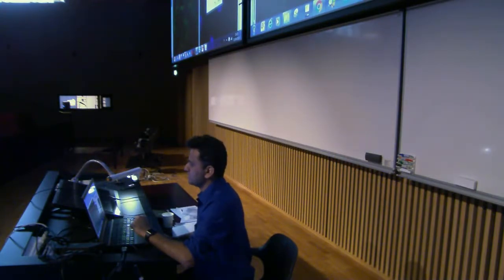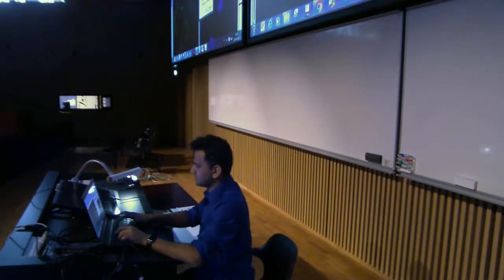Yeah, and this is overlay, and when you change it, that's white. You can change it to whatever color that you want. So red, for example. Okay, so when this is switched on, you can control this color option. So let's put it more sensible, 10 micrometer.